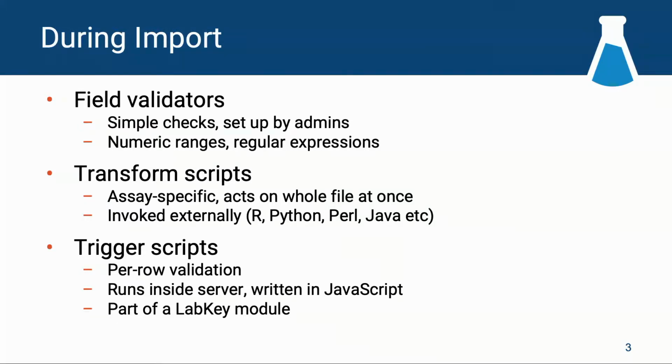And from a developer standpoint, I can say always is a little more definitive than that. So we've generally tended to be a little more tolerant, and that's why in things like lookups, they're not true foreign keys in the database, because that allows us to fill in the data after the fact and have it link up. But that's one thing to be thinking about as you're putting these kinds of import checks into place. Will it be something that's potentially self-correcting like that, where we get the new import of subjects and everything matches up? Or is it, no, this is a bad value, it's never going to be right, keep it out of the database completely?